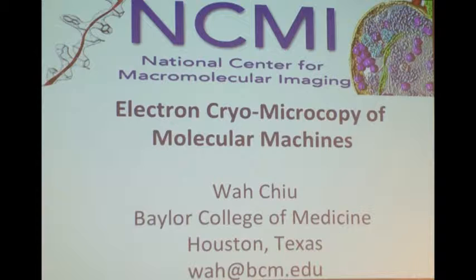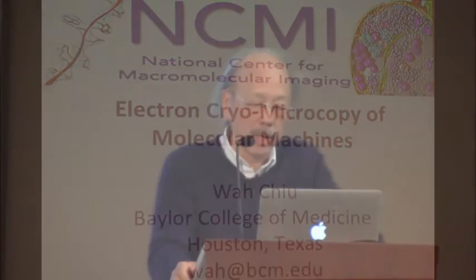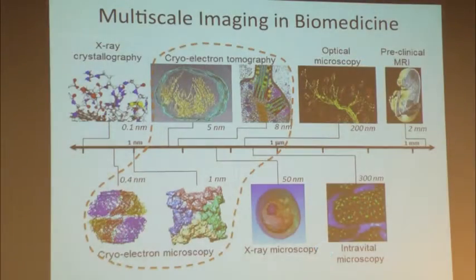What I want to do today is to demonstrate where we are with cryo-electron microscopy. In the area of cryo-electron microscopy, I call this multi-scale imaging or bioimaging. That actually spans a number of technologies from X-ray crystallography, cryo-electron microscopy, optical microscopy, X-ray microscopy, and other types of microscopy. And this spans a very broad range of resolution scale.